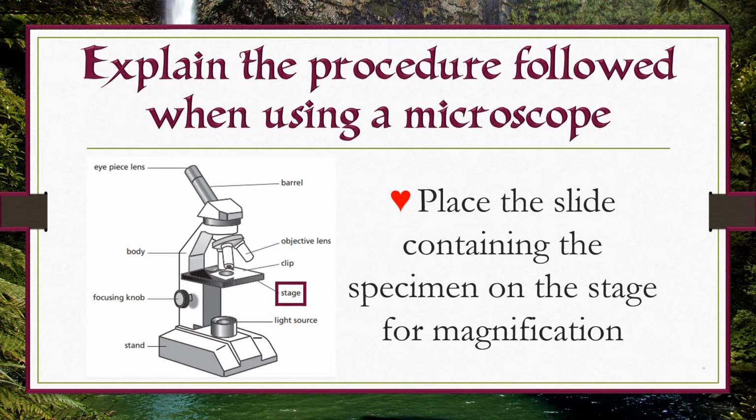Place the slide containing the specimen on the stage for magnification.